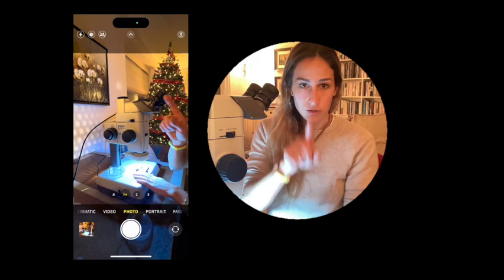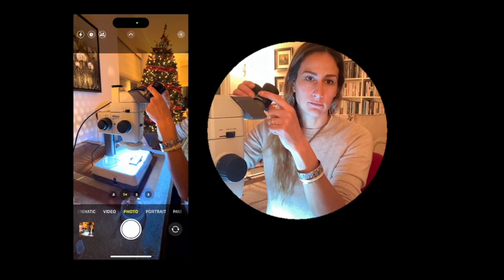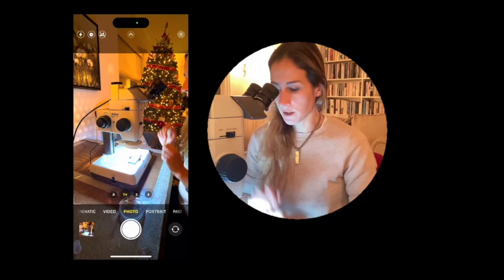First, set what's in focus on the bottom to your computer screen, then match your eyepieces starting at the zero notch on top. Rotate one eye — start with your right eye — to the proper measurement for you, then your left eye, closing the opposite eye as you go. Jot down your eyepiece measurements in case you have multiple users of your microscope.